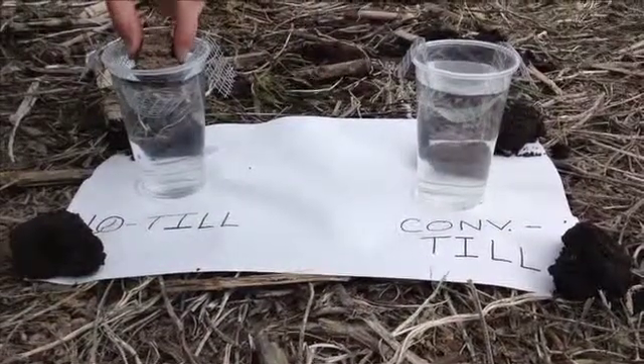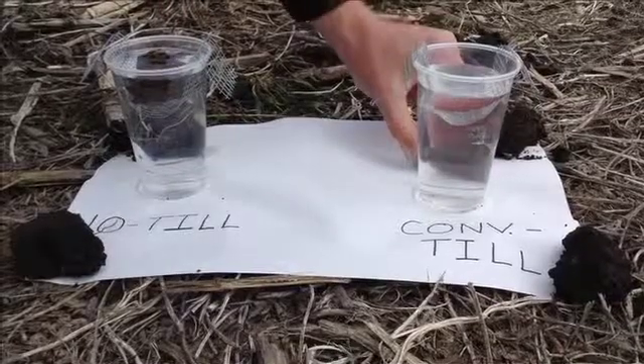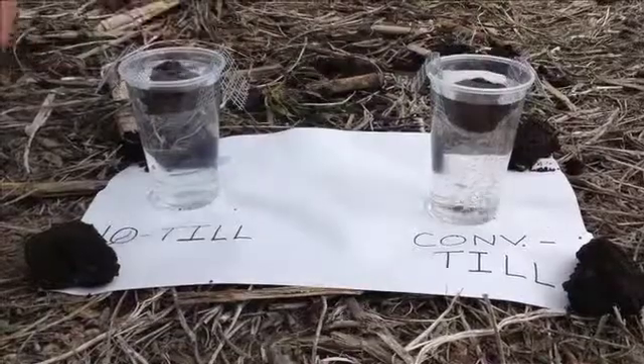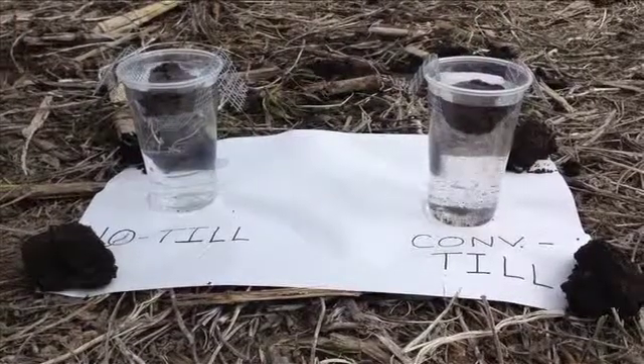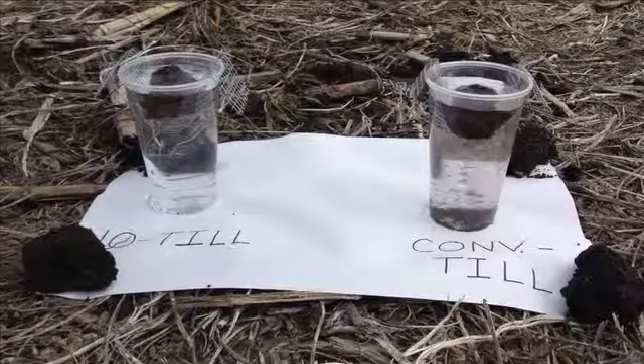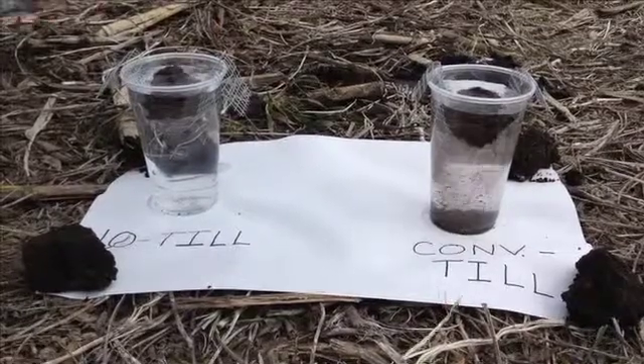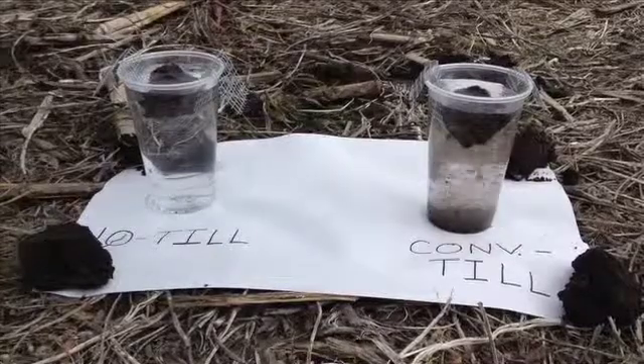This is the no-till with cover crop sample. This one here is the conventional till sample. If you notice, the conventional till sample is slaking away very quickly, while the no-till sample here has become stable.